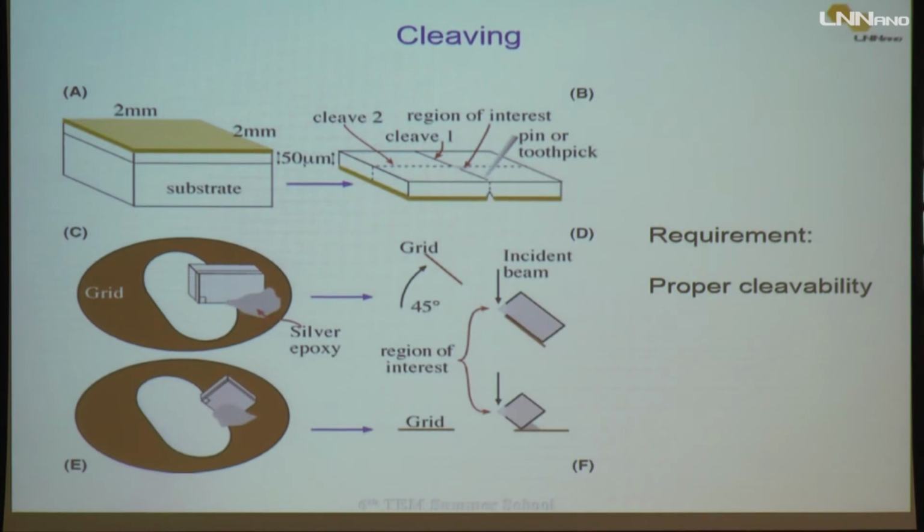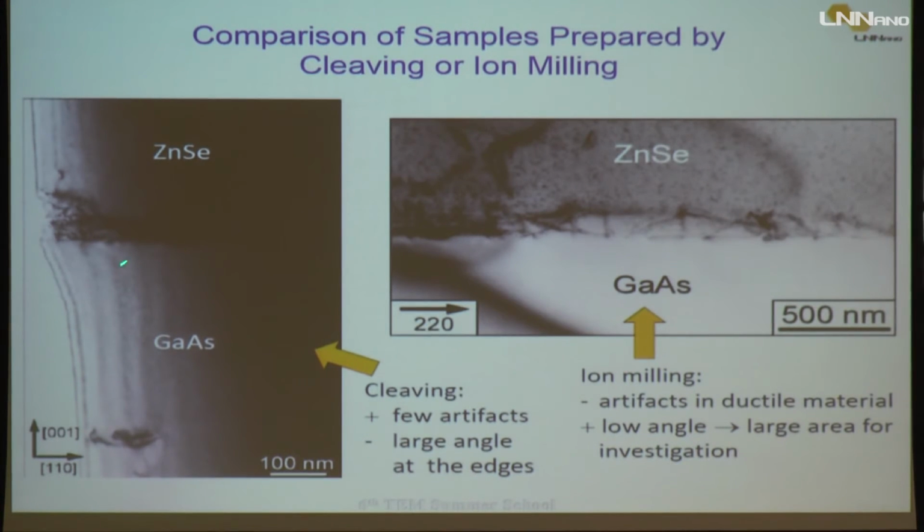You have the possibility, if your material is crystalline and cleavable, you can cleave your material and look at the very edge of your material. You may have this kind of observation.